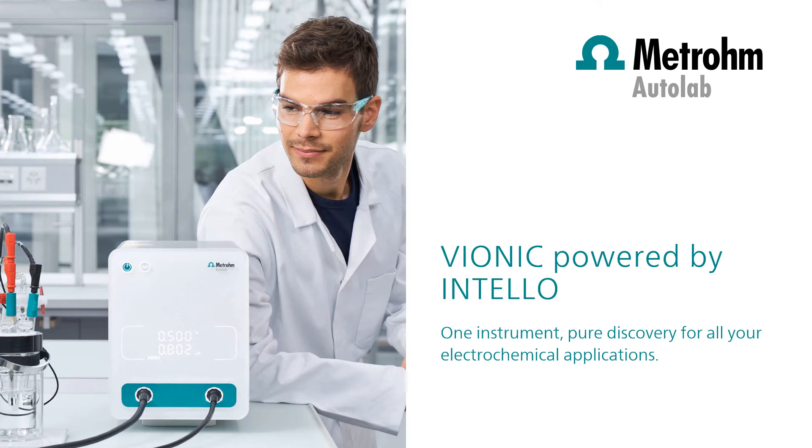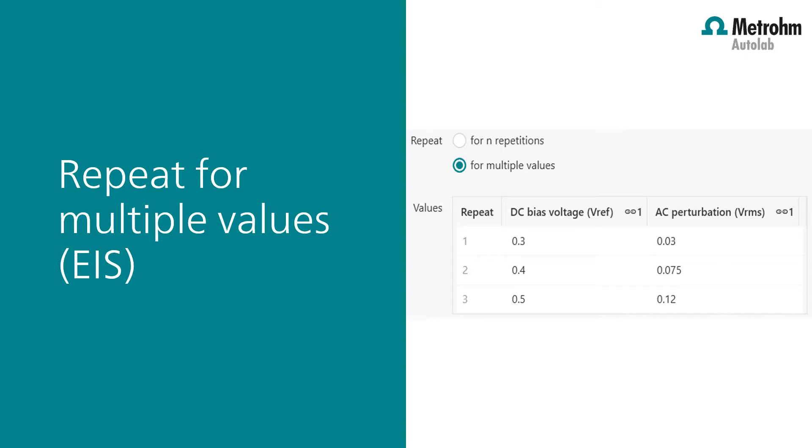Welcome to Intello Videos. The repeat for multiple value command is used to repeat one or several commands with variable parameters for each iteration. The table displays the different repeats in rows and the values of one or multiple parameters in columns for each repeat.